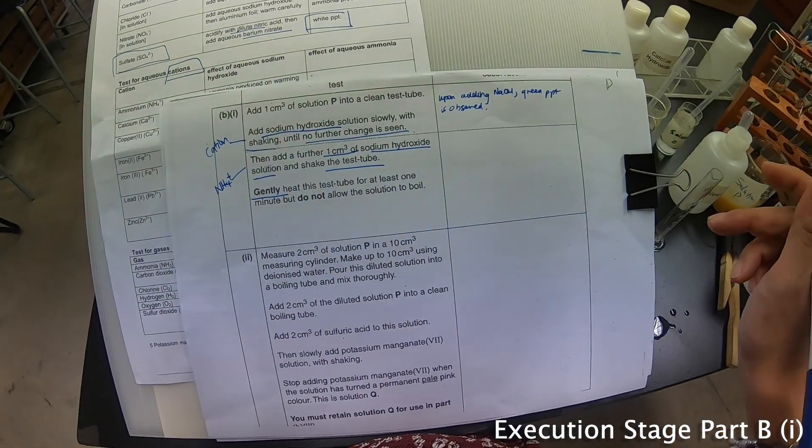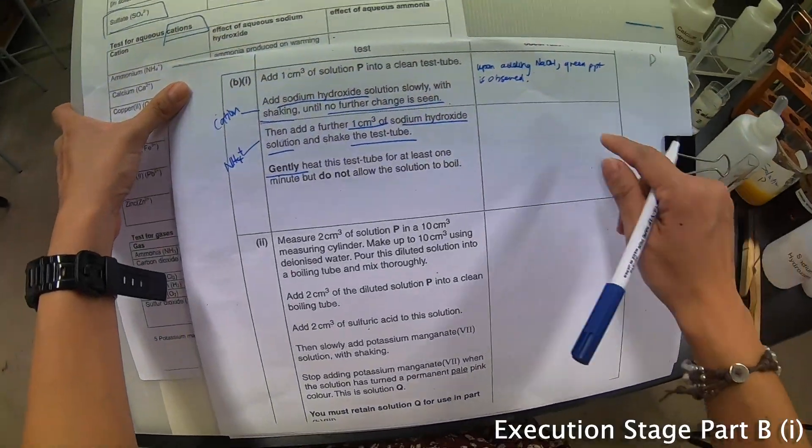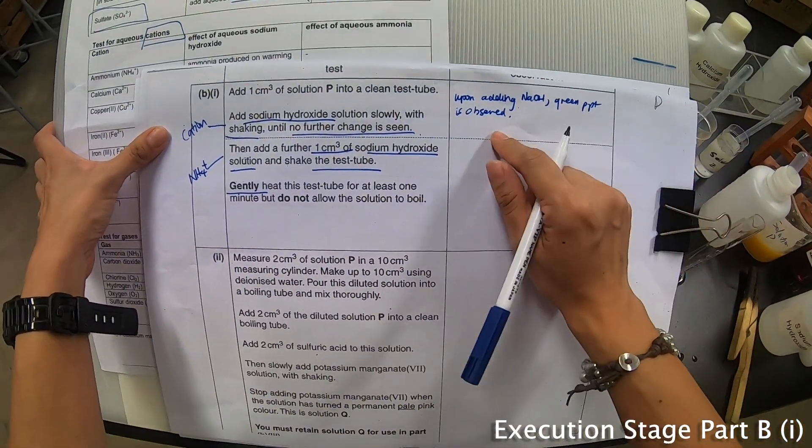A lot of people ask me whether to write 'is' or 'was' — I feel that it doesn't matter because you are doing the practical presently. So just write: green precipitate is observed.